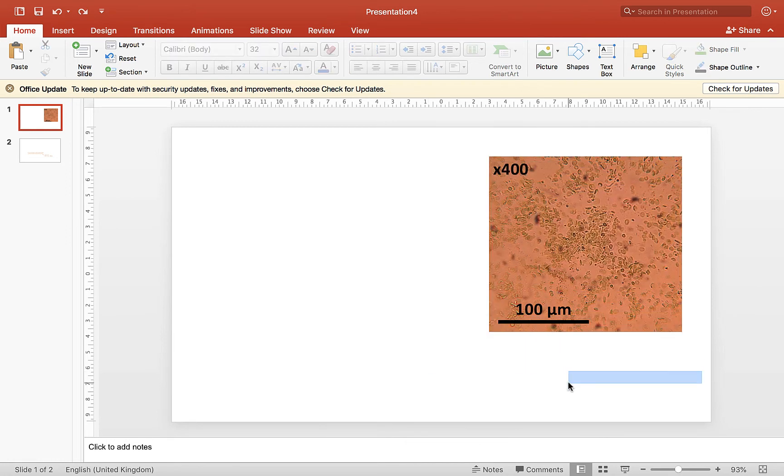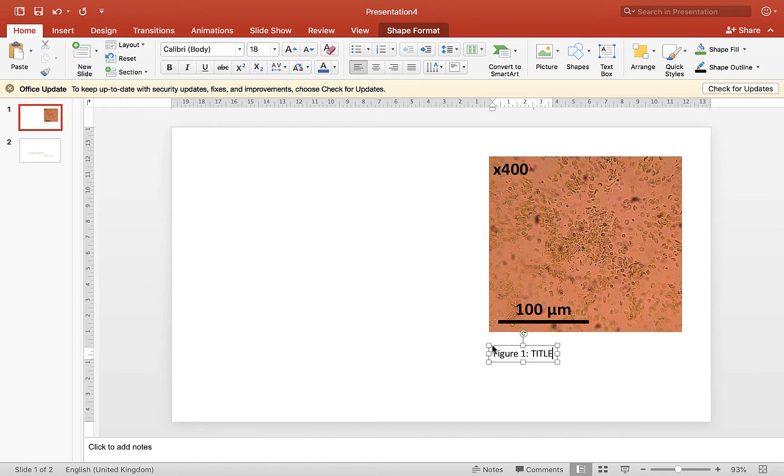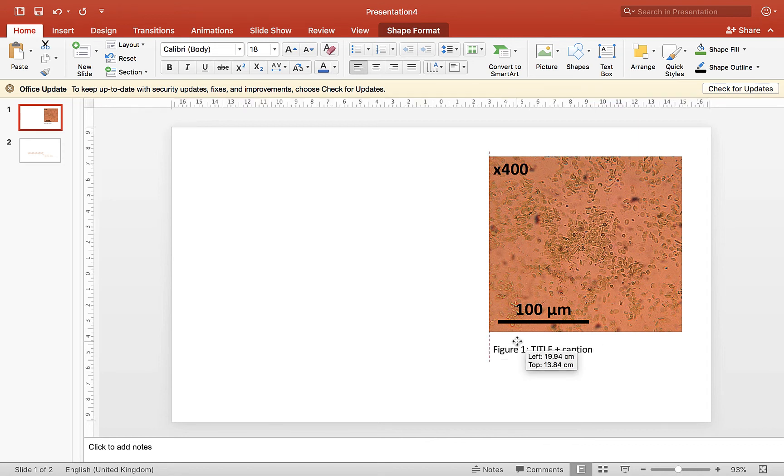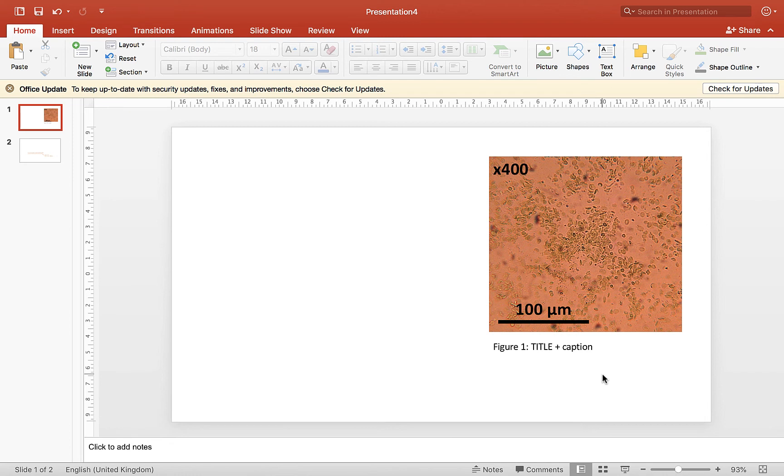So that's then your presentation quality image. You then need to put underneath it, you need figure, figure one in that case, and you need a title, and you need a caption to describe the image. So look at the instructions that I've given you, or how microscopy images are presented in papers, but that's how we go from our two raw images to a presentation quality image.